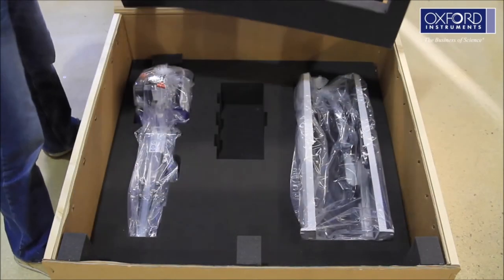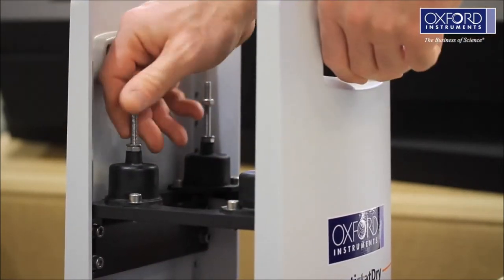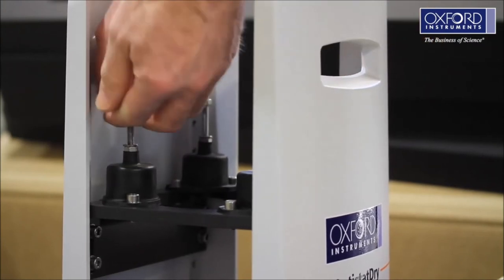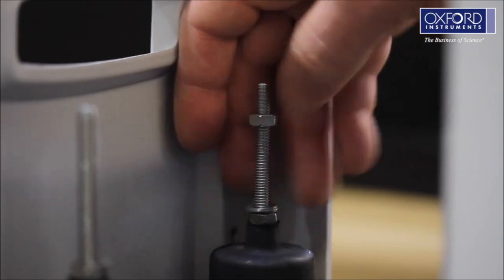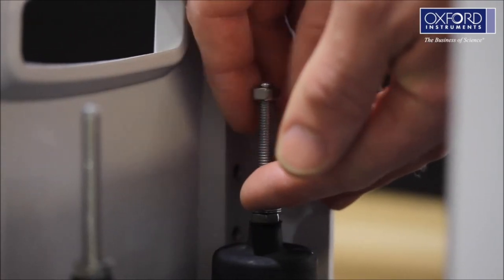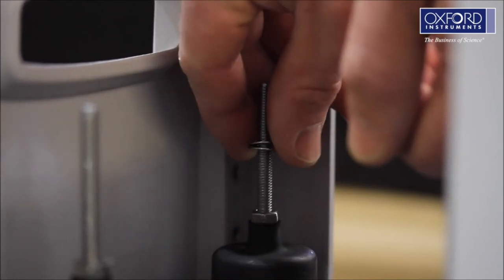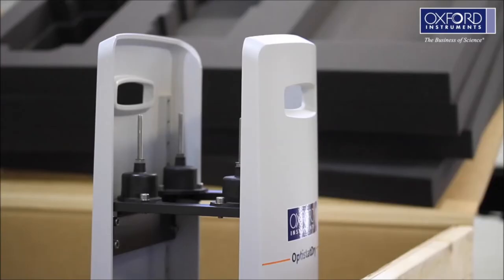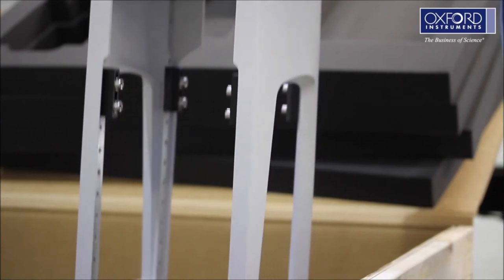If you have ordered a stand, put it into the upright position and remove the plastic bag. Carefully remove the top M6 nut and washer from all four anti-vibration mounts fitted to the support cradle. Be careful not to lose these. The support cradle is set in a default position giving an optical centerline of between 150 and 180 mm above the optical table. If you need to change this, refer to the system manual before proceeding. Remove the stand from the box and place it on the floor.